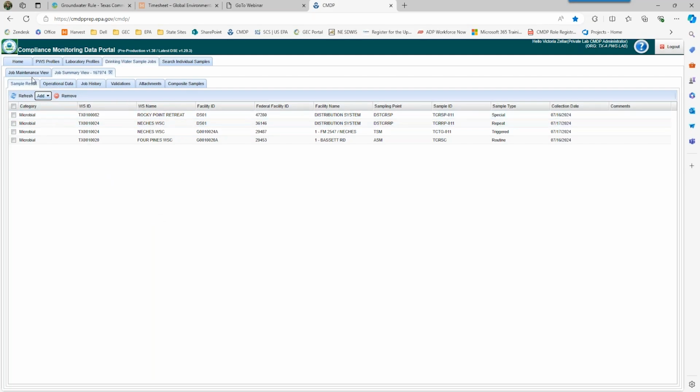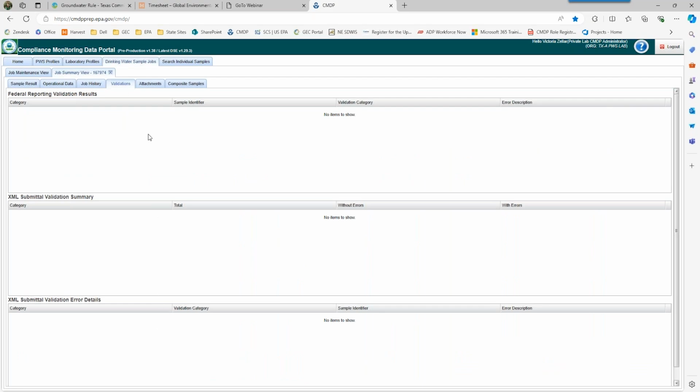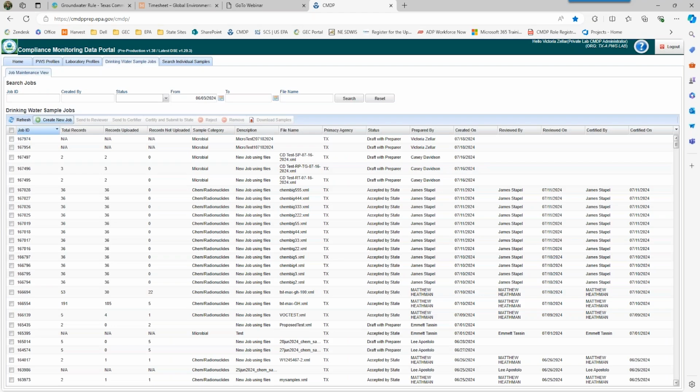Okay, so now I am going to go to our job maintenance view. Oh, I'm sorry, I checked validations one more time. And thankfully, we don't have any errors for all of those samples. So now we're ready to get into reviewing the jobs. So I've entered in all of my samples, and I have 2 jobs. So you could just do one at a time if you'd like, or you could select both. For right now, we're just going to select both for fun.